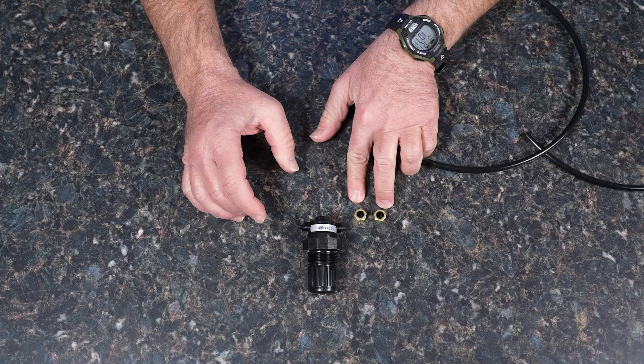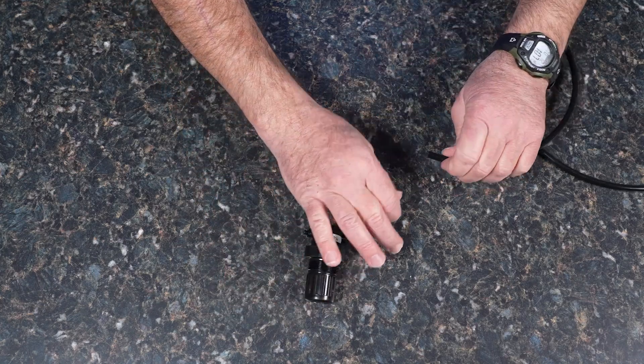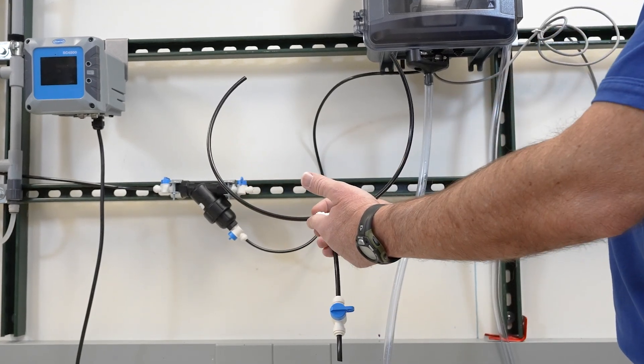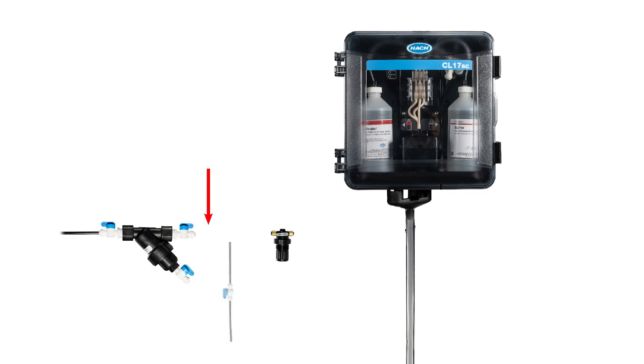Assemble the pressure regulator and grab sample assembly before installation. Attach black tubing from the Y-strainer to the inlet port of the grab sample assembly. Next, attach black tubing from the right side of the grab sample assembly to the inlet port of the pressure regulator. Finally, connect another piece of tubing from the output of the pressure regulator to the inlet port of the analyzer.